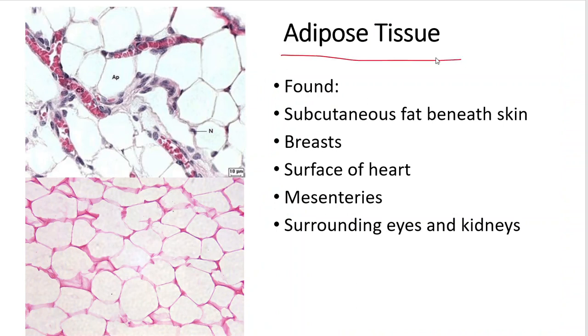Adipose tissue, this is also a type of loose connective tissue. Although in this case, the cells are actually jammed together fairly well. Now, I know that this looks like simple squamous epithelium that's from the lungs, but it's not. How can I tell? Well, there's only one nucleus, and this is basically a bag of oil, triglycerides. These are where we store our extra calories.